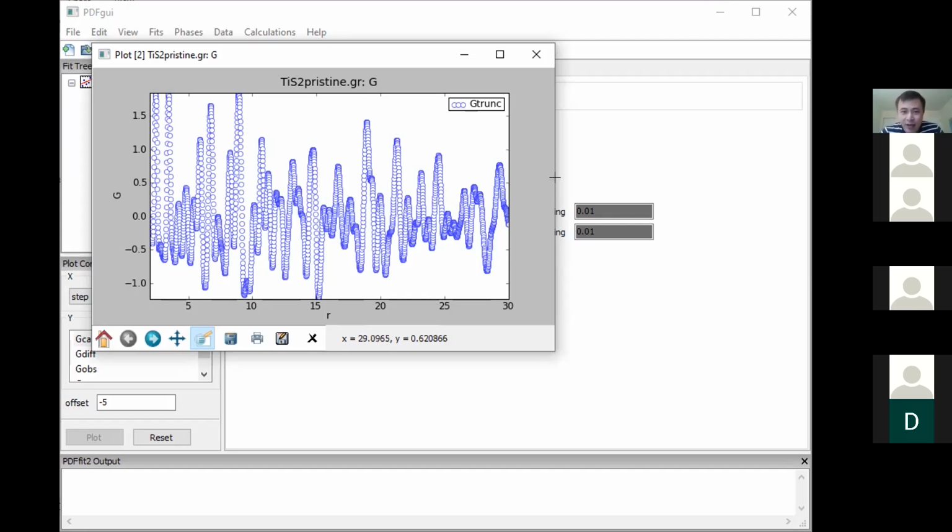And the benefit of that is you will have very little decay over the PDF peaks in the long R region, you will have strong oscillations, let's say even up to 100 Angstrom. If your structure is ordered in that domain, you will have much stronger oscillation. So anyway, the point is, it has two contributions. One is from the sample, the other is from the instrument. And the instrument part is something we need to deal with.